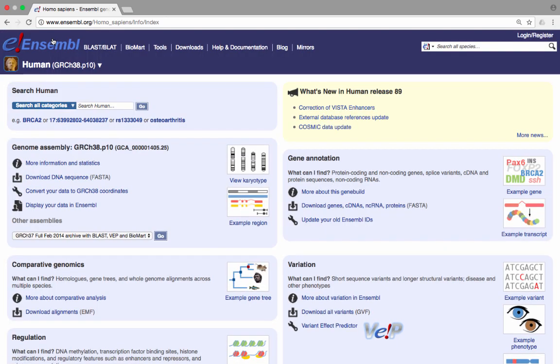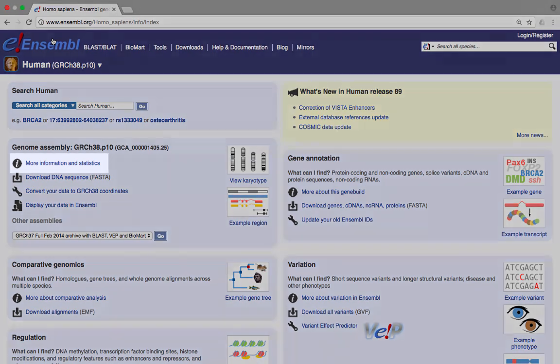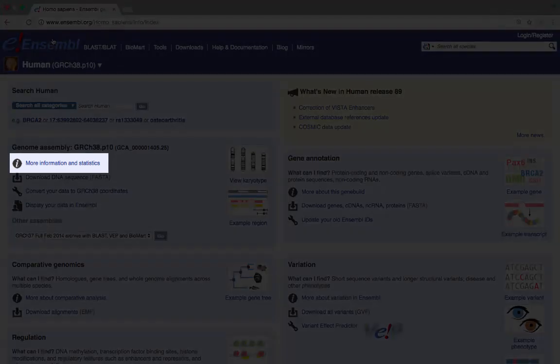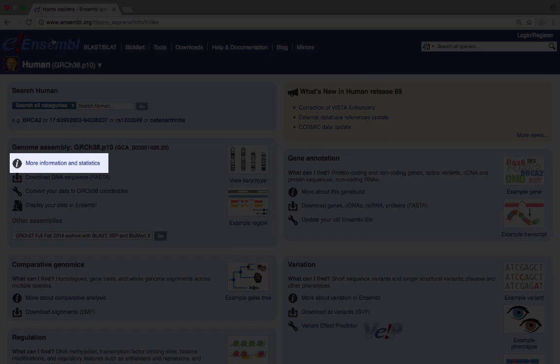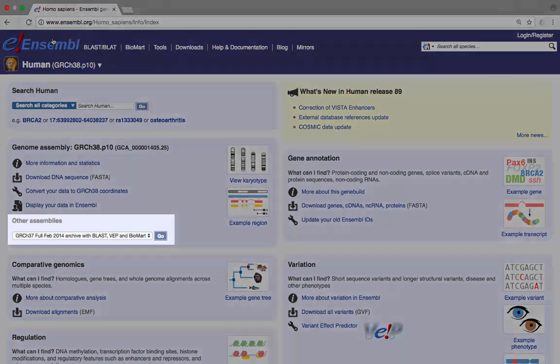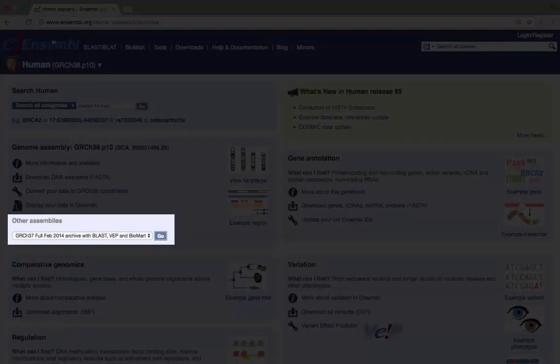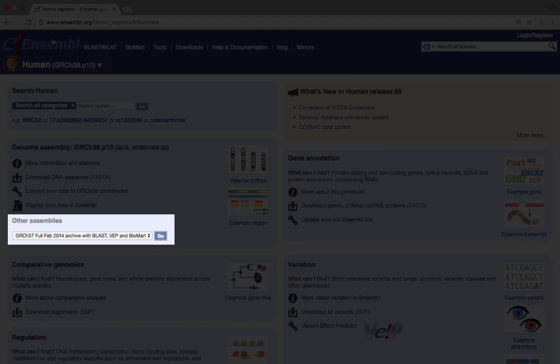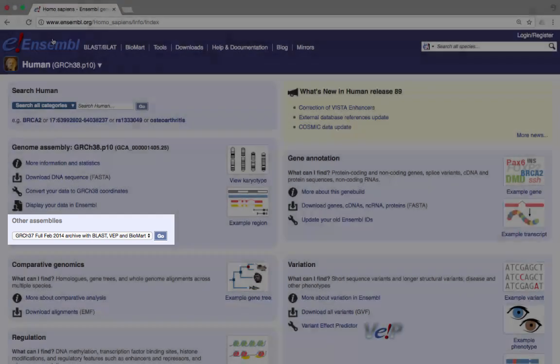Click on the link for the human GRCh38 assembly. Here, we find information about the annotated data for this particular species. You can find out about the gene annotation methodology, the comparative genomics analyses, variation data, and regulation data. You can also find out about the genome assembly itself by clicking on the More Information and Statistics link. Or you can jump to our browser dedicated to the GRCh37 genome assembly.